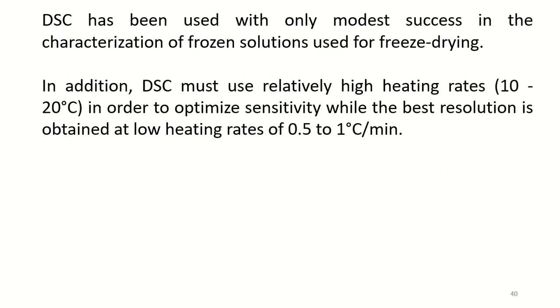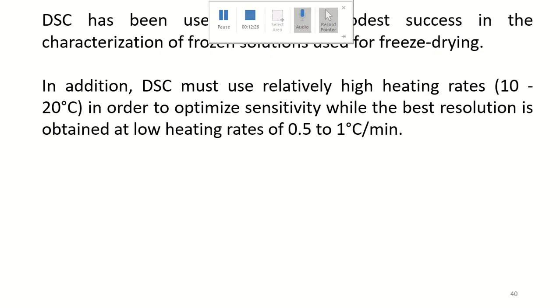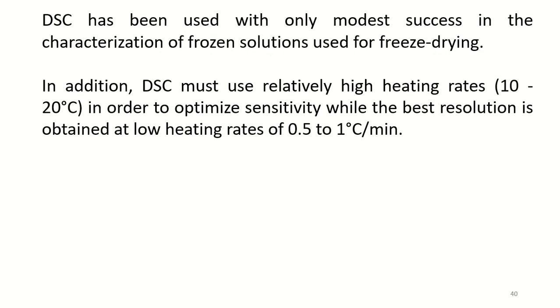In the introduction section of new differential scanning calorimetric technologies, it was explained how modulated differential scanning calorimetry has both an average and a modulated heating rate.